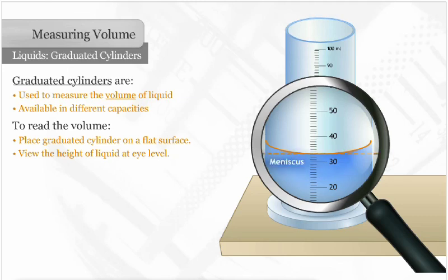To get the most accurate measurement, read the volume at the bottom of the meniscus. In this example, the volume is 33 and two-tenths milliliters.